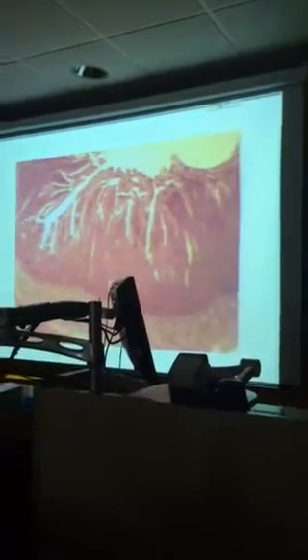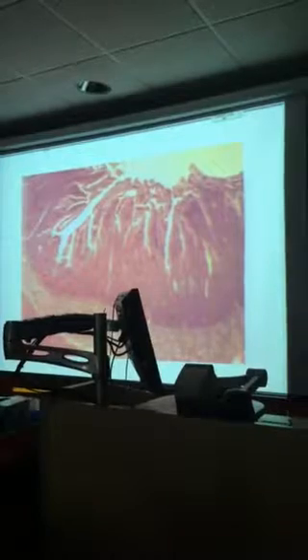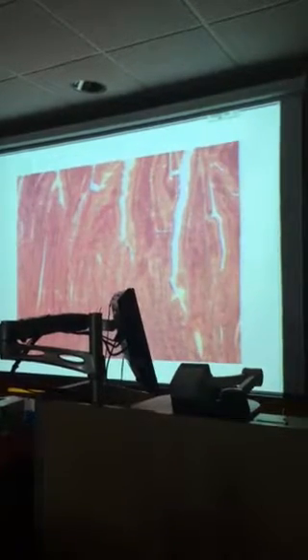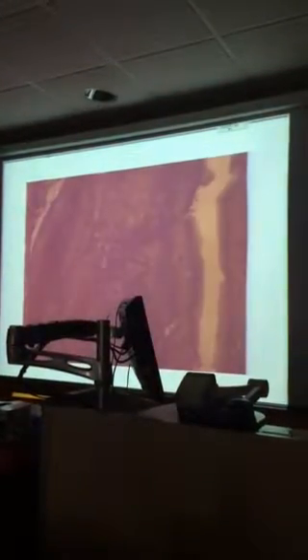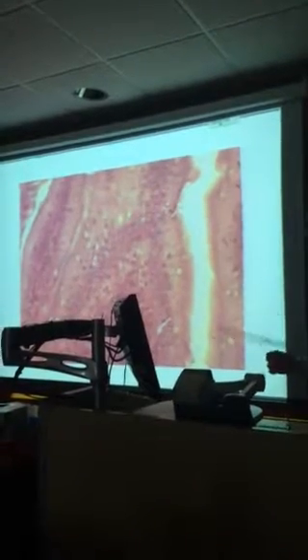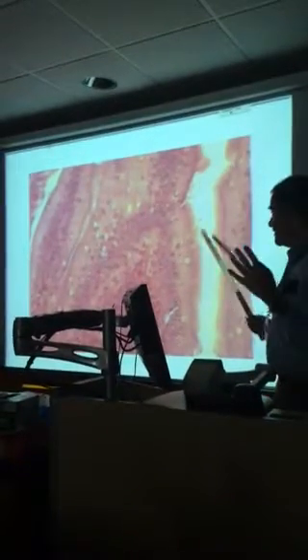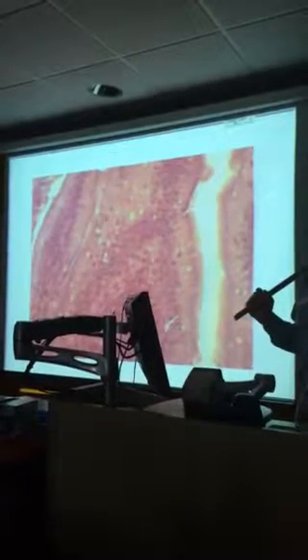And when you look at these villi under the microscope, it almost looks like they're fuzzy or ciliated. They're not. It's just that that's the best we can do for looking at the microvilli. And we got some villi, as you can see. But we can't clearly see the microvilli. They're too small to be seen. So what it does appear as, we got kind of a fuzzy border here, almost like it's ciliated. But in fact, these are folds in the cell membrane of the epithelial cells that cover the villi. And because it looks like the bristles of a fine brush, they're called the brush border.